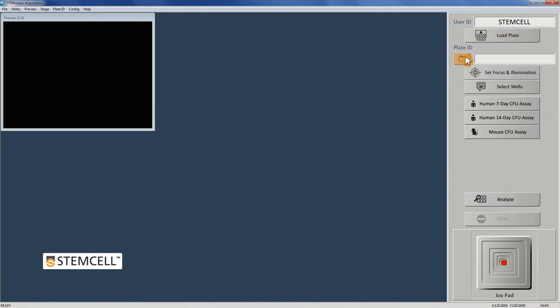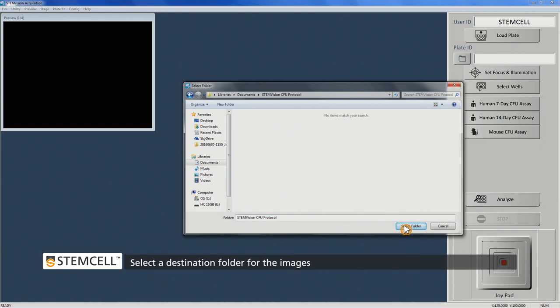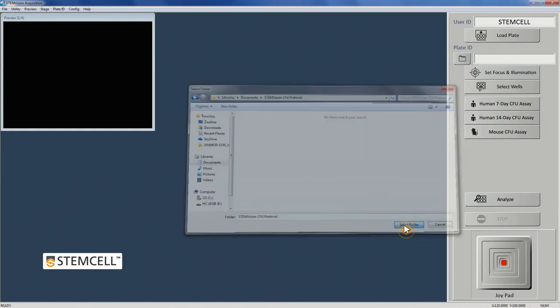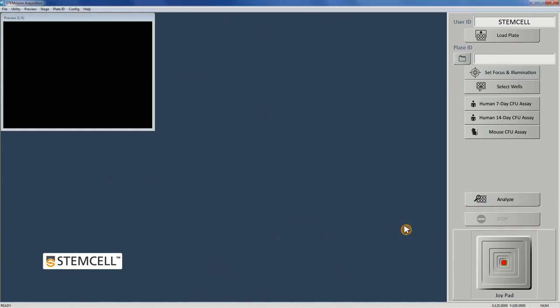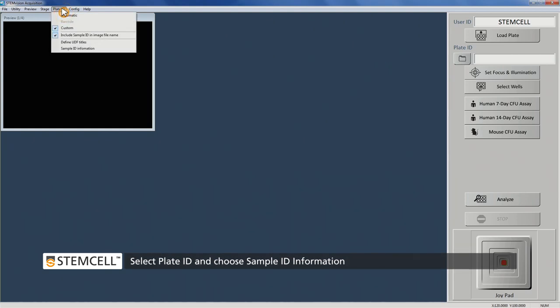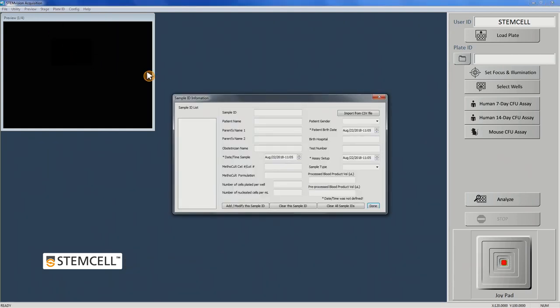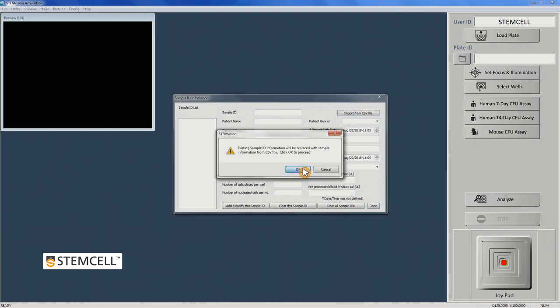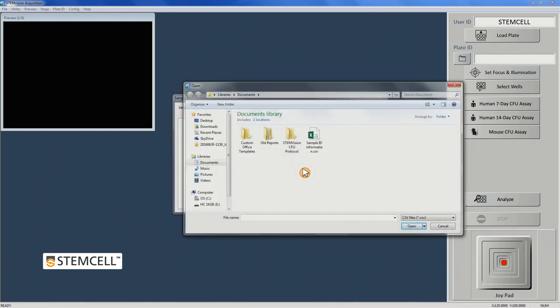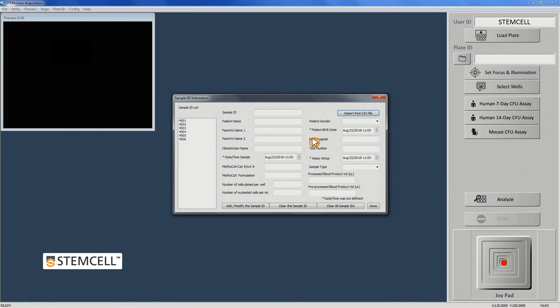Select a destination folder for the images. If you have pre-populated a CSV file with sample IDs, it may be loaded now. Select Plate ID in the top menu and click Sample ID Information. Choose Import from CSV File in the New dialog box and browse to select the desired CSV file. The list of samples extracted from the CSV file will appear on the left side of the dialog box window under Sample ID List. Click Done.